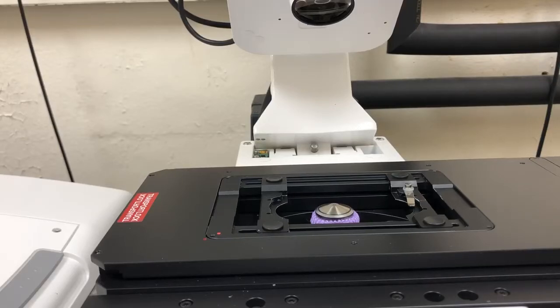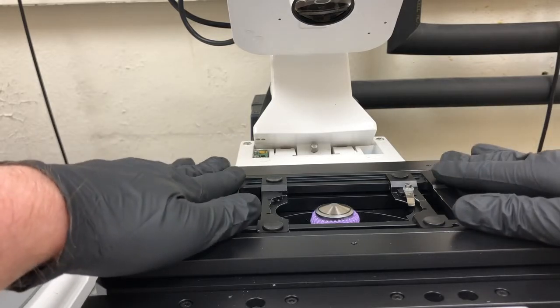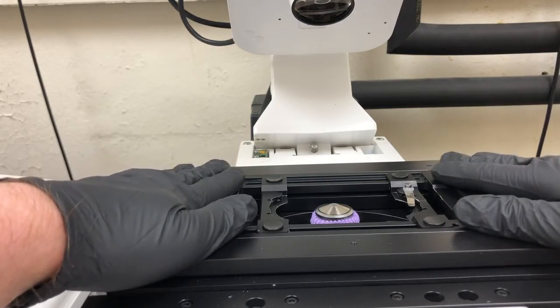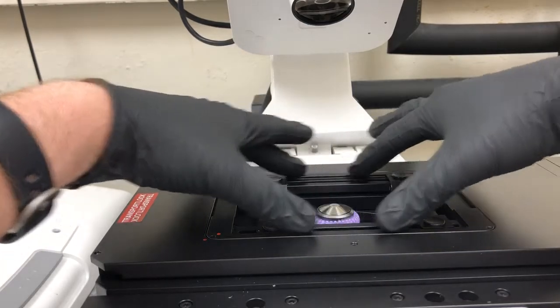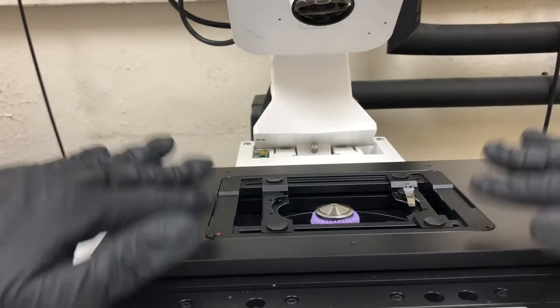So how do we properly set up the stage with the sample holder and a sample on that holder? This is a little bit different on the 710 and on the 700 — the ideas are the same, it's just that the 710 is a little bit more sensitive, so we have to be a little bit more careful. The first thing is that we want to check that the holder is properly in position.